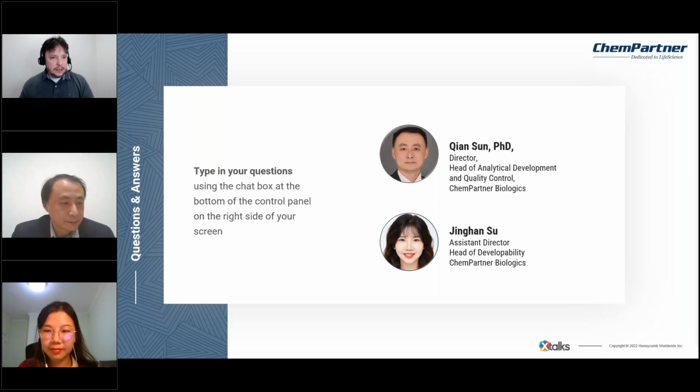Very good. Thank you for that. Next question for you: what are the LC-MS characterization strategies for heterogeneous proteins?